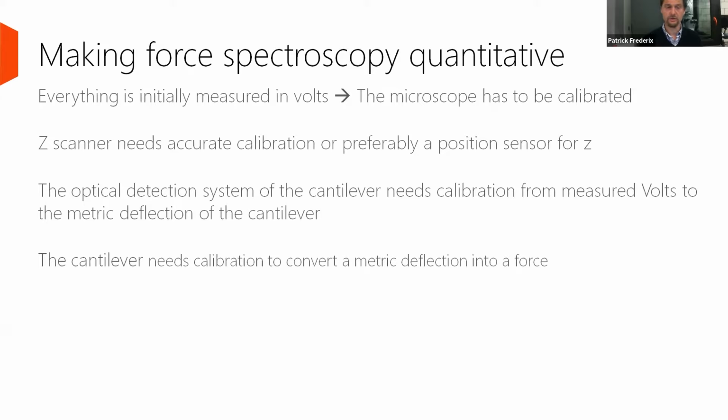In addition, you need to know the spring constant of the cantilever. Although all manufacturers give a design spring constant or nominal spring constant, it may deviate from it. And for that, you need to measure the spring constant.